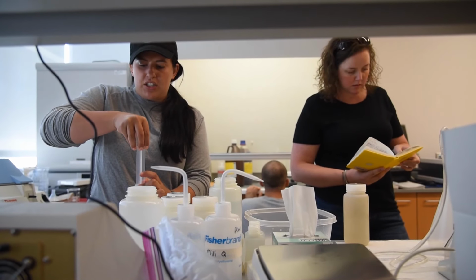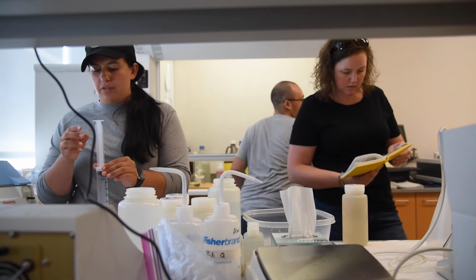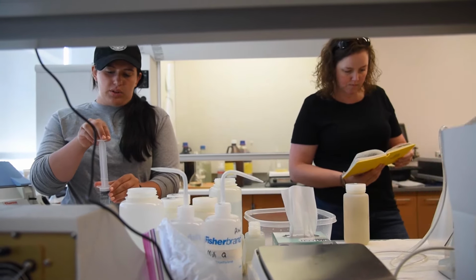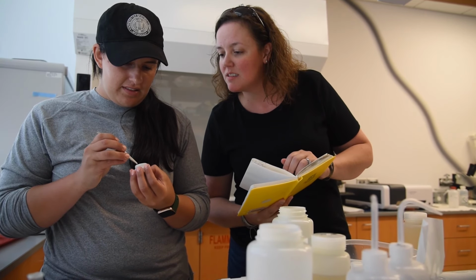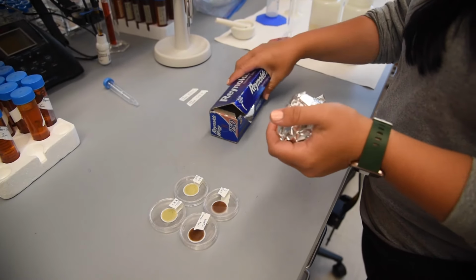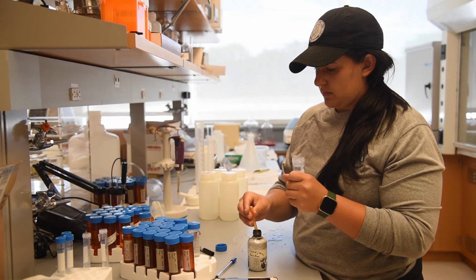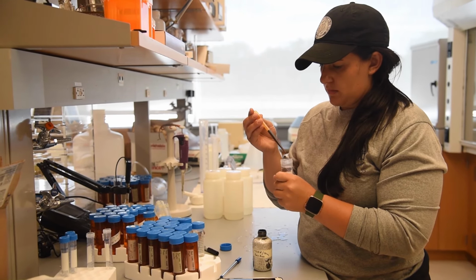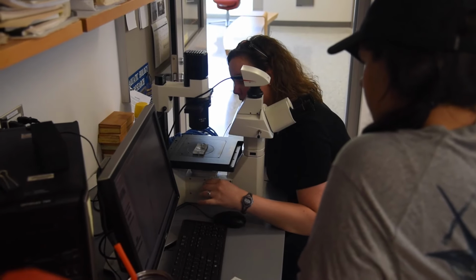We also take out of our soap wash bottles, we'll look at chlorophyll, and we'll filter out for chlorophyll at each depth just to get the overall algae biomass reading. We will eventually process both the nutrient and the chlorophyll sometime later on in the season. We do chlorophyll about every 2 weeks, but nutrients we will save just for the end of the season.